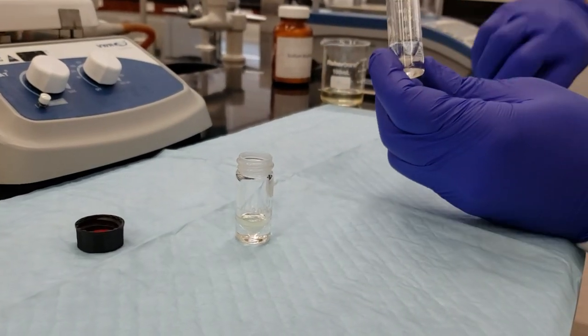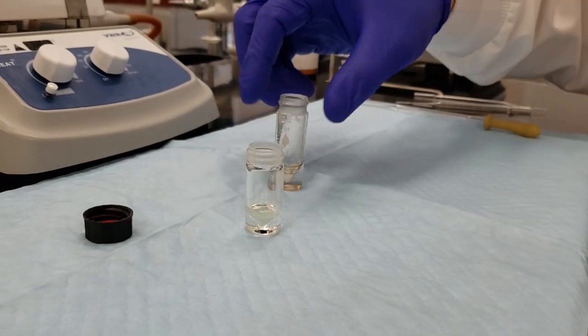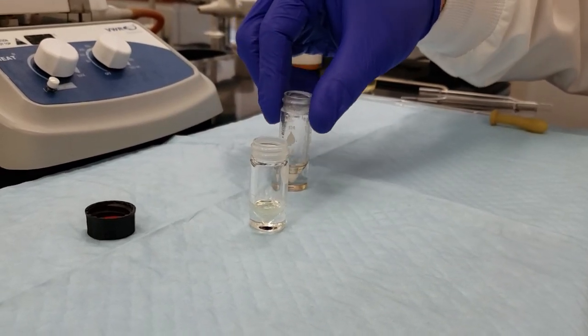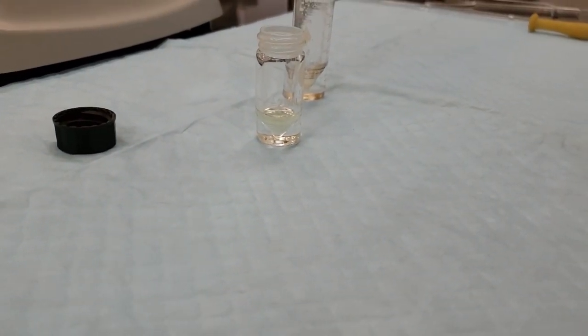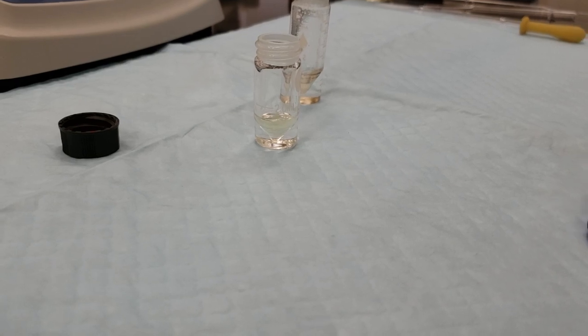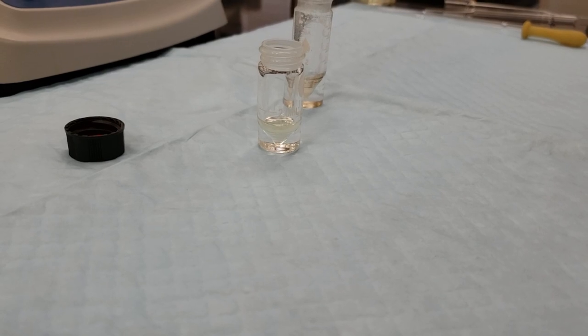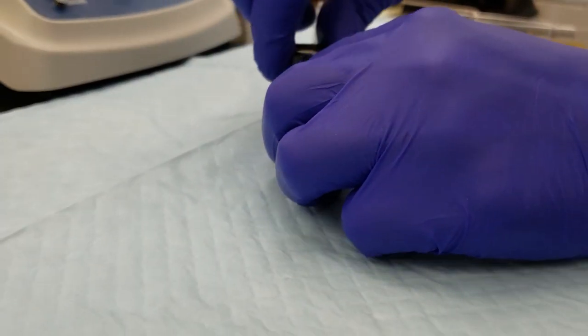And that's about the most that we can get out of there without accidentally taking some of the bicarbonate. We can see that there's still some liquid remaining. So we know that the weight that we get off of this 3 mL conical vial isn't going to be perfect. We'll write that up accordingly in our lab report. But we've got enough that we can go ahead and analyze it using our GC. We'll cap this and we'll show you what the GC looks like.